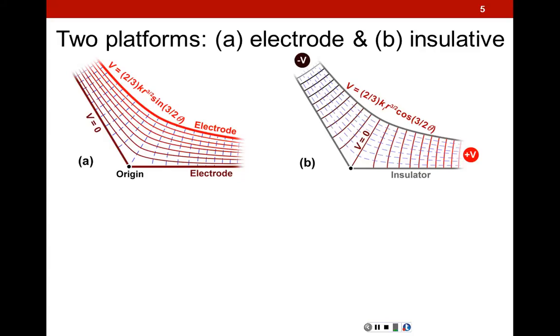So we're currently developing two platforms. One is electrode-based, where the sidewalls of the channel are electrodes, with a particular geometry to do what we want in terms of a dielectrophoretic response. You can also have another geometry in terms of an insulative feature, so these are plastic sidewalls. In terms of manufacturing, we can look at it from, say, an injection molding type of process on the right, whereas the electrode has more complex microfabrication but a more precise technique on the left. We're currently developing both platforms.